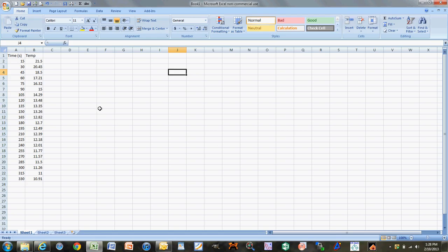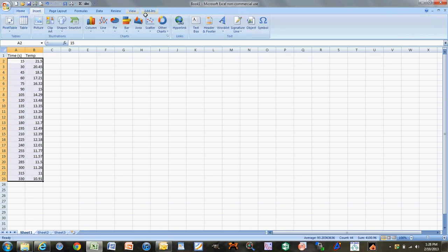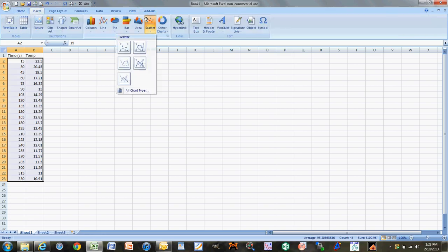What you're going to do is take one column, label it 'time,' and pull out all your time measurements along with the corresponding temperature measurements. Once you have that set up, highlight just those two columns, drag it down — and notice I did not include the cells that have the column headers in them.